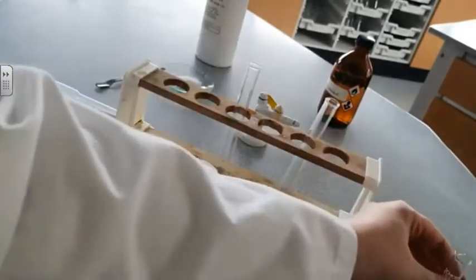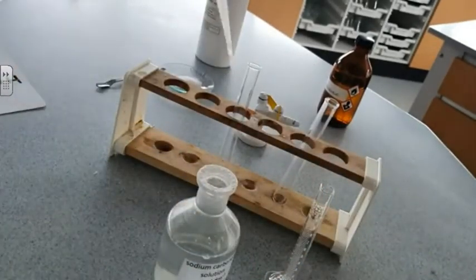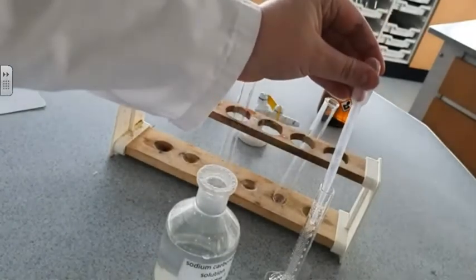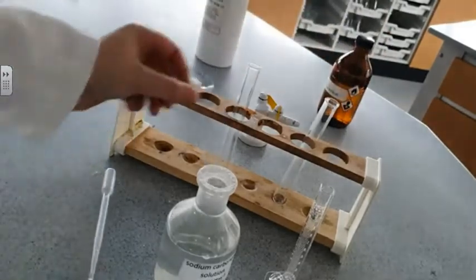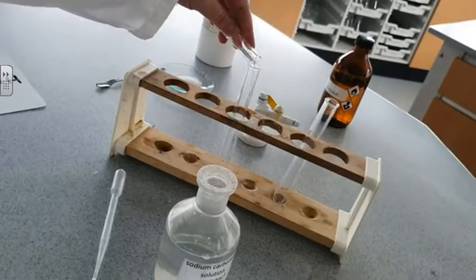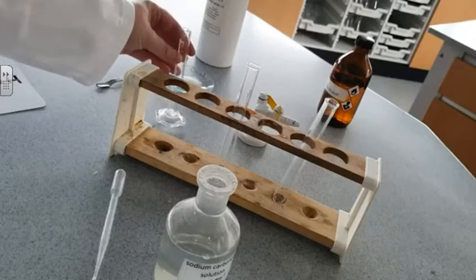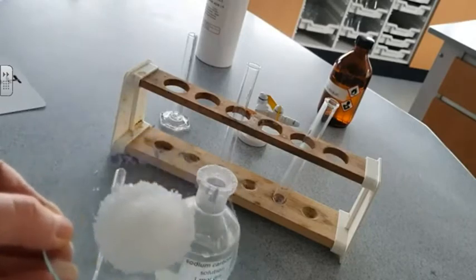To test for a carboxylic acid you use either sodium carbonate or sodium hydrogen carbonate solution. These solutions react with acids to form a salt, water and carbon dioxide. And it is the production of carbon dioxide that gives us the positive result in this test. Carbon dioxide is a gas, and so if there is a carboxylic acid present, we should see some effervescence.